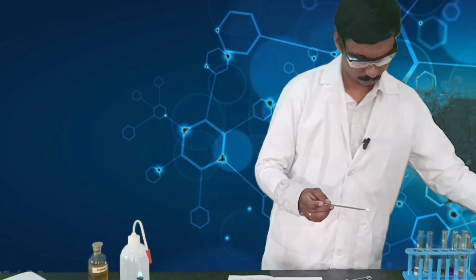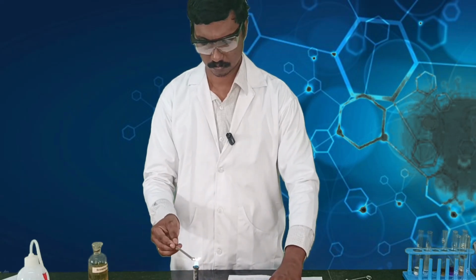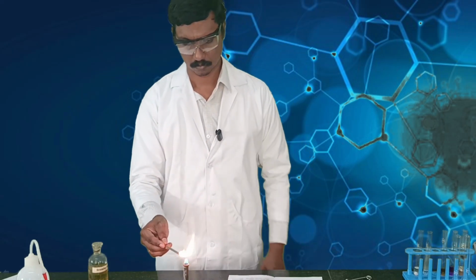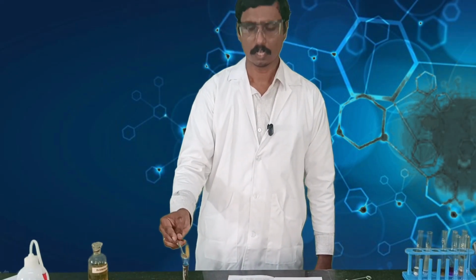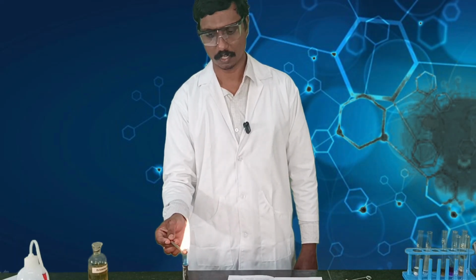The next test that we are going to perform is called the ignition test, where you take the compound on a spatula and heat the compound vigorously. If it ignites with black fumes, as you observe, it tells you that it's an aromatic compound. If it doesn't ignite, if it is an aliphatic compound, it will not give that black smoke. So you can see the difference between an aromatic compound and an aliphatic compound.